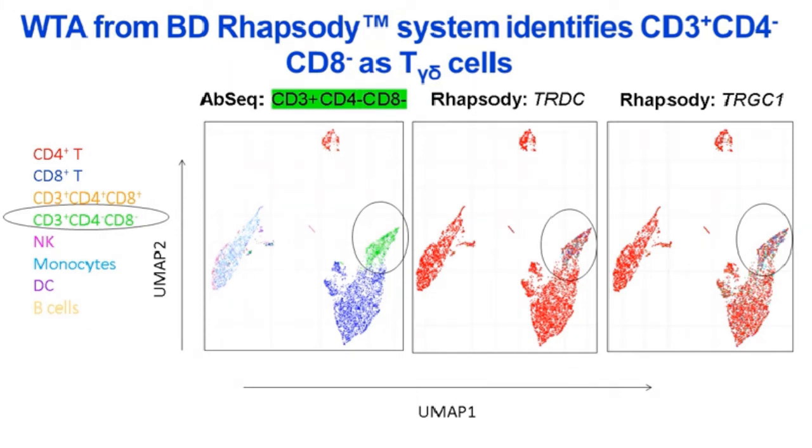So there was basically a discovery we performed, and this is about 16% of the total cells that we are looking at in these plots. There was a discovery that after CAR T cell infusion, just 7 days post-infusion, you can obtain up to 16% of gamma delta T cells circulating in the blood. Now, of course, the next question would be, what are those cells doing? And of course, we are undergoing further experimentation to characterize those cells.